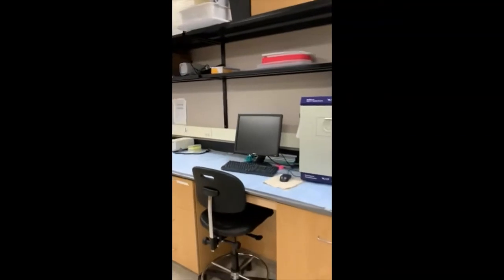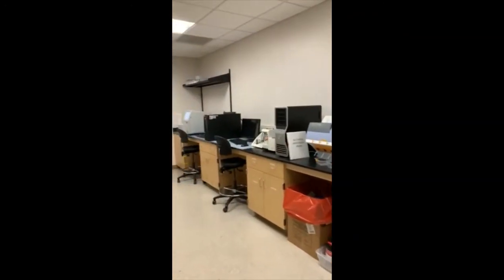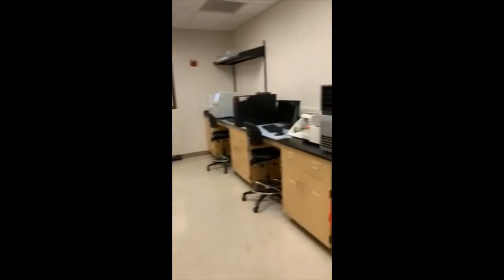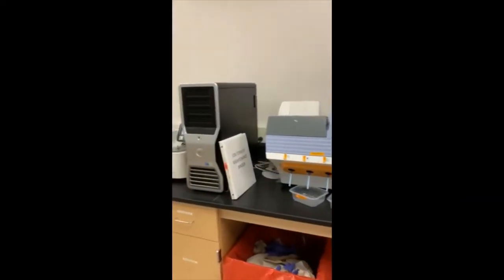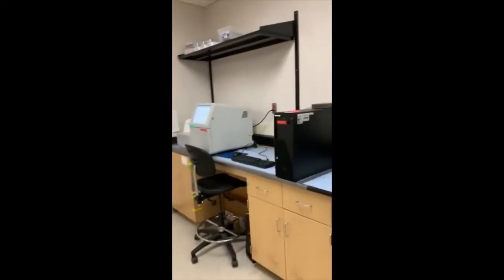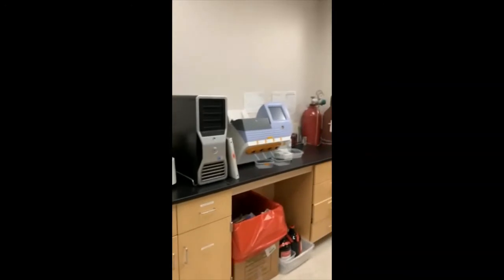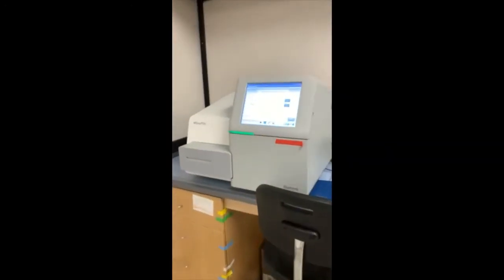Now, that's not the only thing you can do with microbes. We also have a couple of projects ongoing here that are using bacterial signatures to identify forensically relevant body fluid samples. Now, to do this, we do use what's called massively parallel sequencing. This is basically a function where we're able to put DNA in machines, hundreds of samples at one time, get our results relatively quickly and very confidently. So for that, we do have an Ion Torrent and more recently acquired the MiSeq FGx.